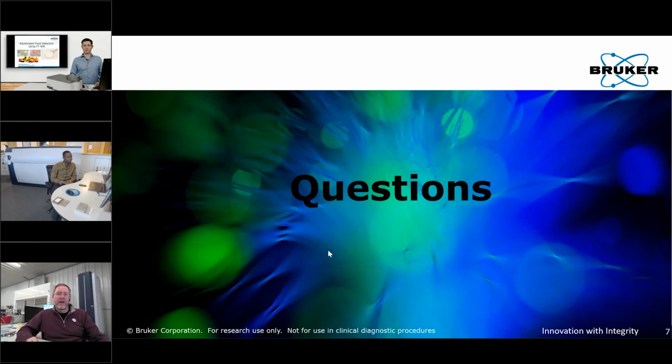Interestingly, what I did not demonstrate today is that there's another software package available called PolyTools, which is capable of identifying these unique repeating patterns. That's the first stage we do: we identify repeating patterns, and then we interpret what that means in terms of what phytochemical structures could be present. That can also be applied in the lower molecular weight range, for monomeric units and simpler, smaller molecules. But yes, we do a lot of basic discovery work with the MALDI system as well.